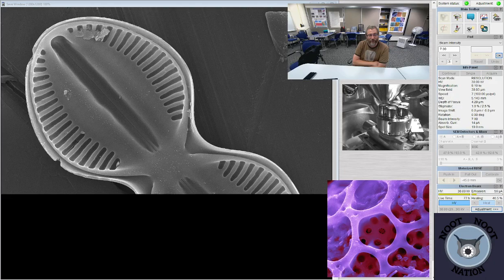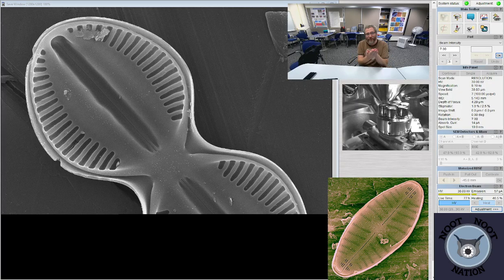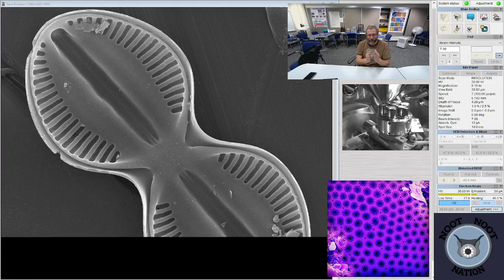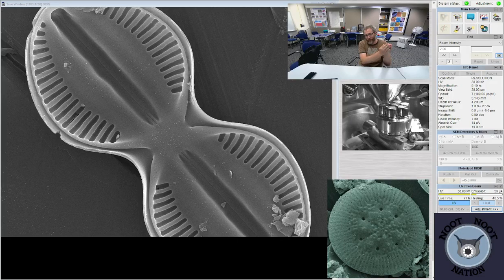That is one diatom, and this is just one valve, so it's actually half of a diatom. Not that it's splitting, but that's actually the shape of the outline of the diatom, and we're looking at the inside of it, so there's another one that would fit over top of it that's exactly the same shape as this one. That would be the outside view if we could see it. That's the internal view of one diatom. And when diatoms split, they would divide in the direction that we see it. They would add girdle bands, make themselves a little bit wider, and then form a new half of a valve inside on this one, and a new half of a valve inside on this one, and then split apart into two diatoms. They would still all look like this, though.